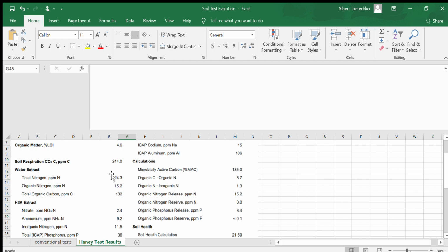That is going to be variable throughout the year, as are much of the things within the soil test. But that's a really good indicator. Now that would be a good baseline starting point for me. So if I tested the soil at roughly the same time of year every year, I wouldn't want to see this number go way down, and if it went way up, that would be a good thing. But you'd want to use this as somewhat of an indicator.